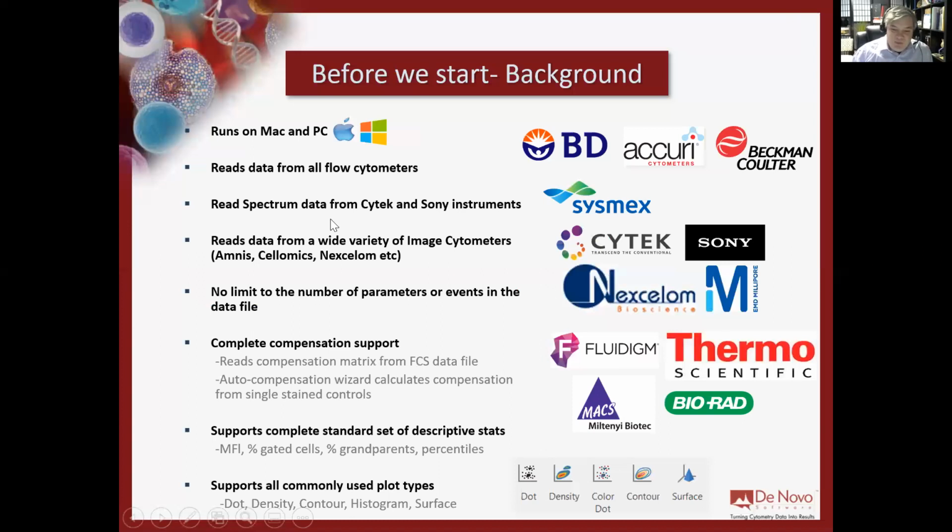All right. So before we start, I do want to remind everybody that everything we see today in FCS Express, you can do it on a Mac or PC. You can do that interchangeably. You can save something on a Mac and open it up on your PC. The site license at Memorial Sloan Kettering Cancer Center allows folks to install FCS Express on as many different computers as they want, right? So on a snow day like today, you can take your data from the lab, we're working on a PC, you can run it on your MacBook at home, bring it back to the lab whenever you get dug out and get going.